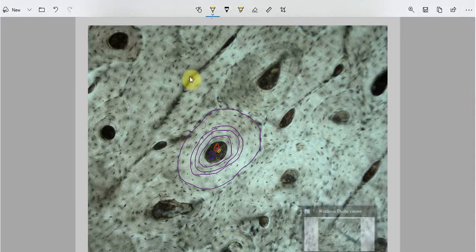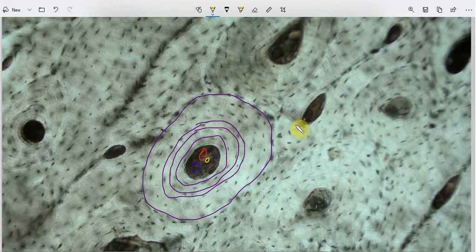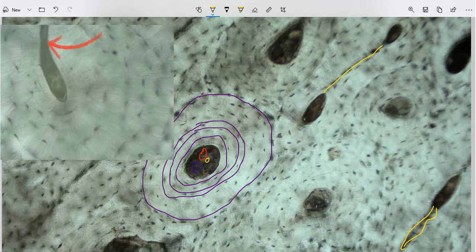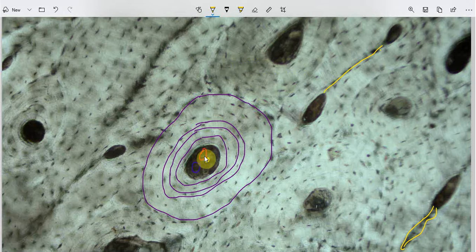The adjacent Haversian canals are interconnected with each other. For example, this Haversian canal is interconnected with the adjacent Haversian canal, as you can see on higher magnification. This interconnection of the Haversian canals is known as the Volkmann's canal. These Volkmann's canals also contain anastomoses between the blood vessels and nerves to provide rich vascular supply throughout the bone.